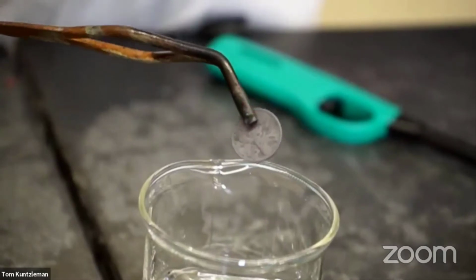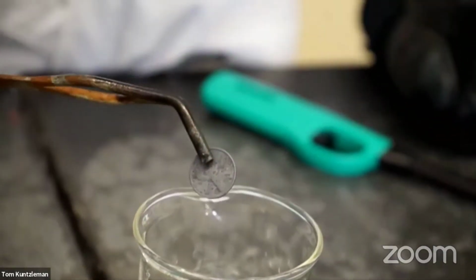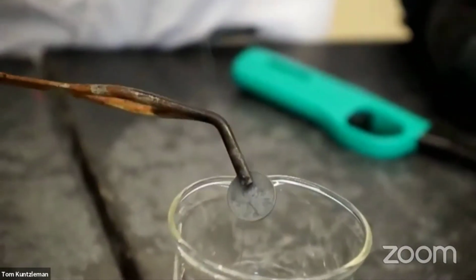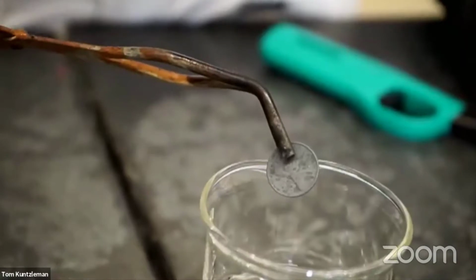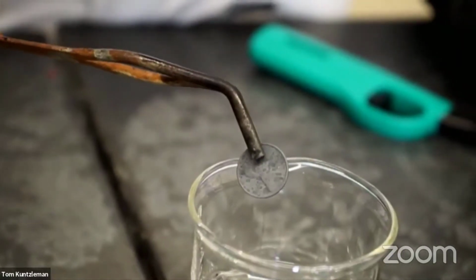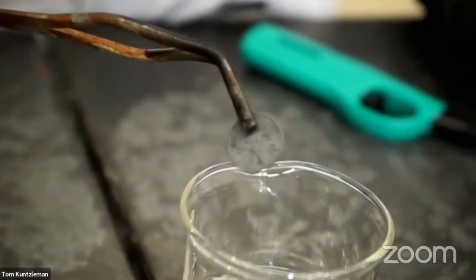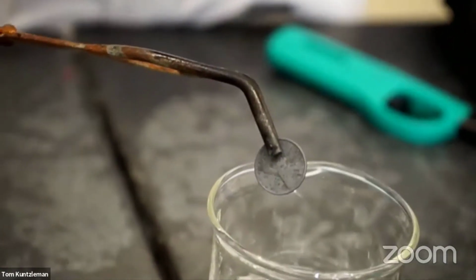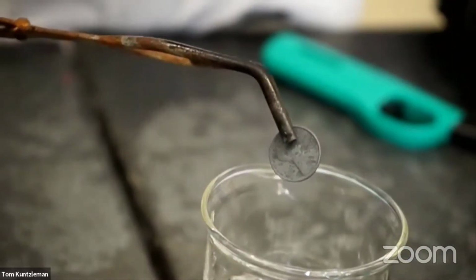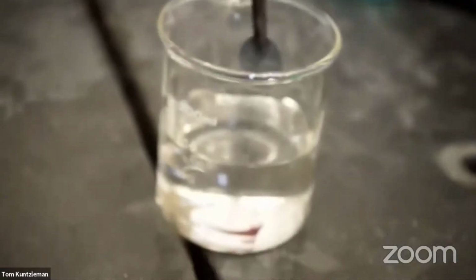Doesn't look like a penny anymore. Well, okay, it looks like a penny, but it doesn't look like the color of a penny anymore. It looks black, doesn't it? It sure does. And you know what that tells me? That tells me that the copper on the penny is reacting with oxygen in the air to make copper oxide. So we've now taken the copper metal and made a compound out of it. I'm going to go ahead and put this in the water and let's see what happens.